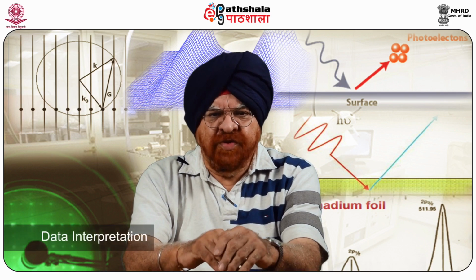Now we come to data interpretation. This is one of the very important aspects of this study. The technique limits the signal to noise ratio of images extracted from spectroscopic mapping, and it depends mainly on the signal processing methods. This is certainly true for electron energy loss spectroscopy, in which pre-edge power law background modeling can significantly affect the accuracy and the range of the extrapolated determinations.